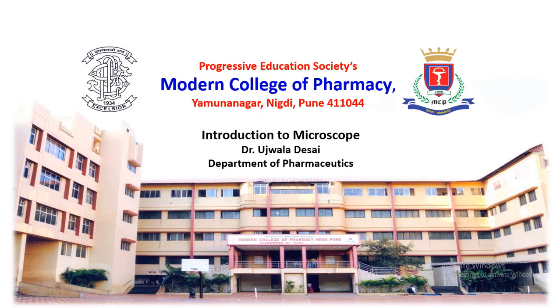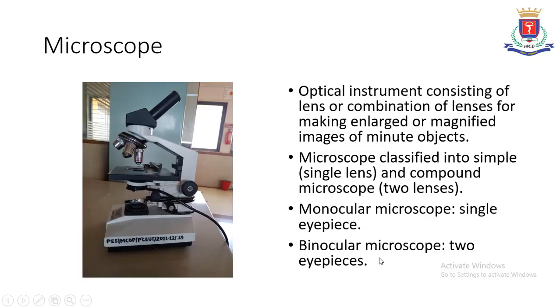So today we will see Introduction to Microscope. What do you mean by microscope? What are the different parts of microscope and what are the different types of microscope? So we will move on to first definition of microscope.